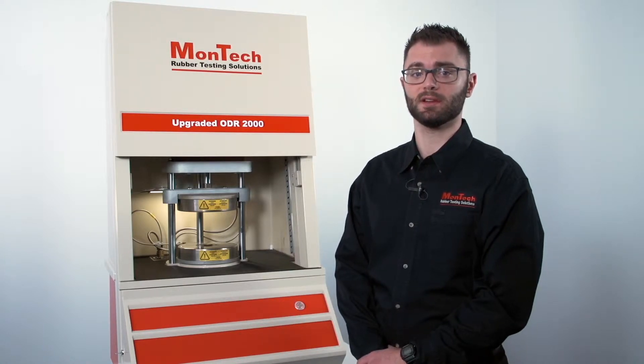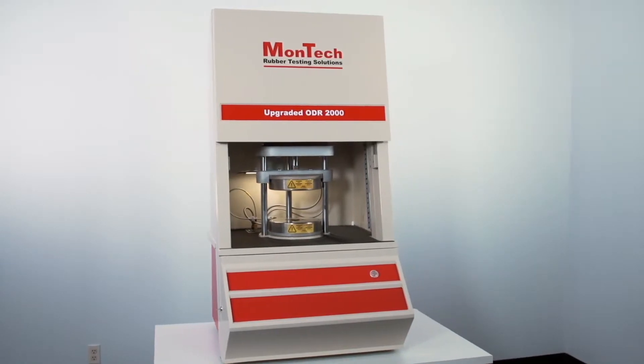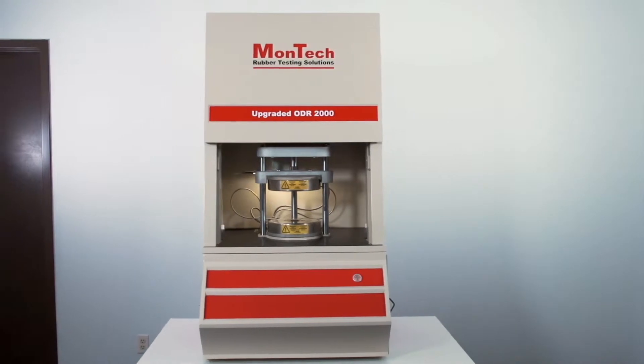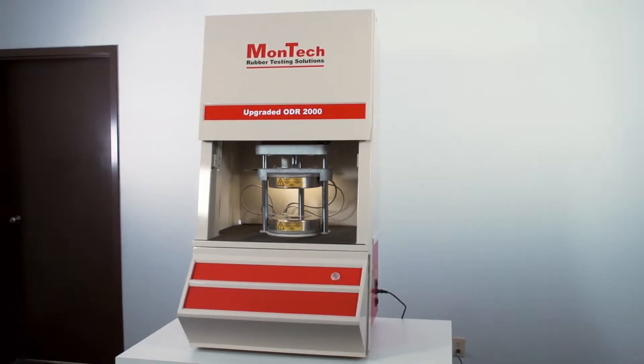The Montech upgraded ODR-2000 is the perfect budget-friendly solution for modernizing your legacy oscillating disc rheometers. Installed by our skilled technicians in our ISO 9001-17025 accredited facility, each Montech upgraded instrument is completely restored with over 75 new and rebuilt components.